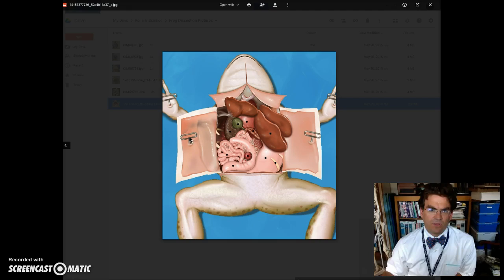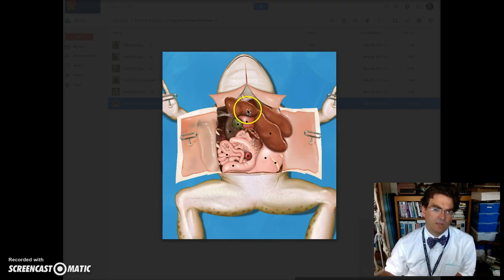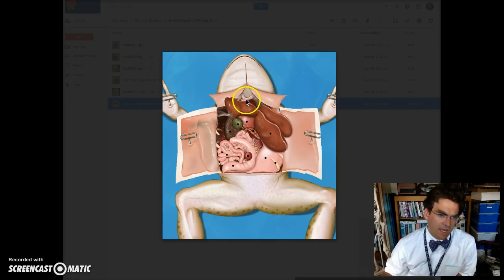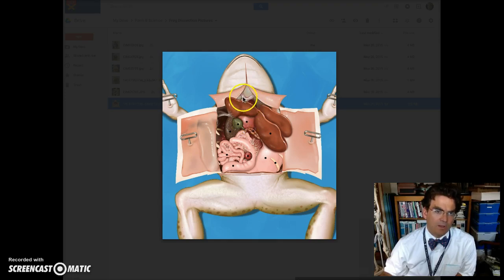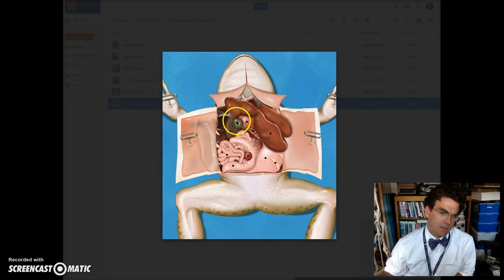We'll first start with the liver. In this picture, the liver are these big giant three lobes right here, so there are three of them for your frog. The next one is the heart, and the heart is kind of hiding out here — it pokes through there, right in this top region. It kind of gets covered up by the liver, but there is your heart. The next is the gallbladder — the gallbladder is this green little sack right here. So that is your gallbladder.